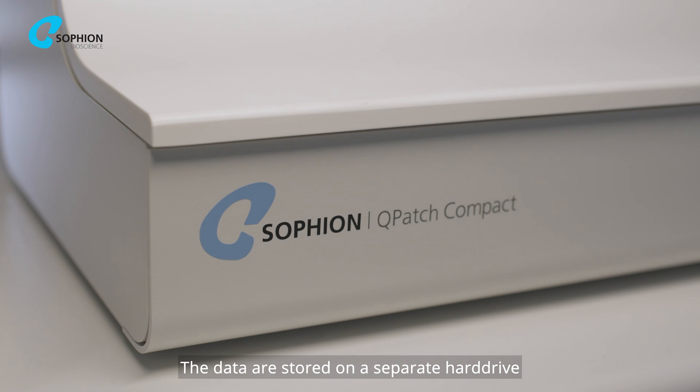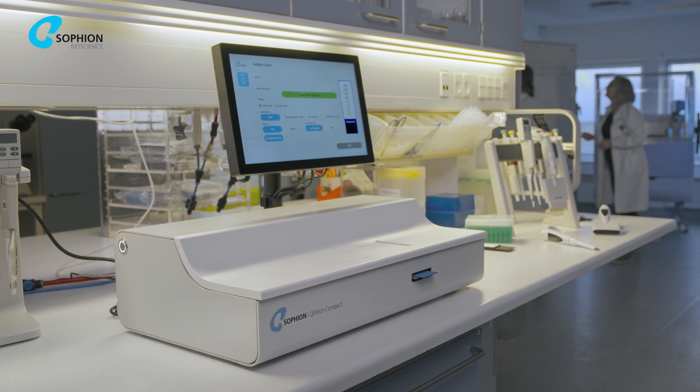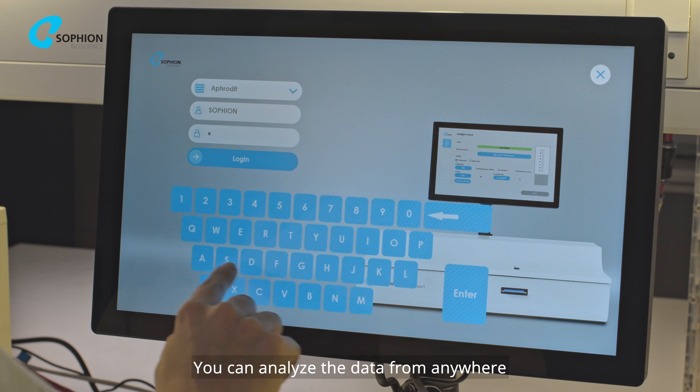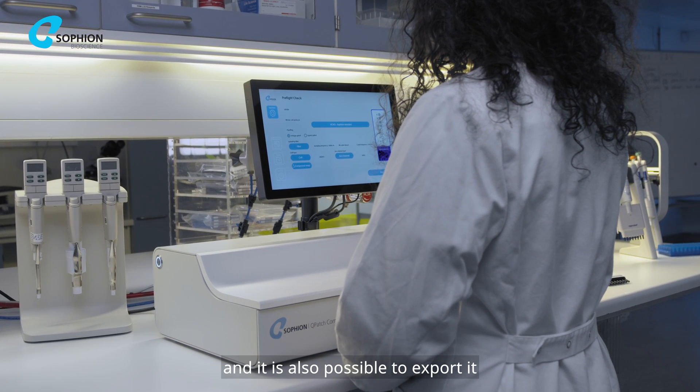The data are stored on a separate hard drive inside the instrument and there is automatic backup. You can analyze the data from anywhere without any extra software, and it is also possible to export it.